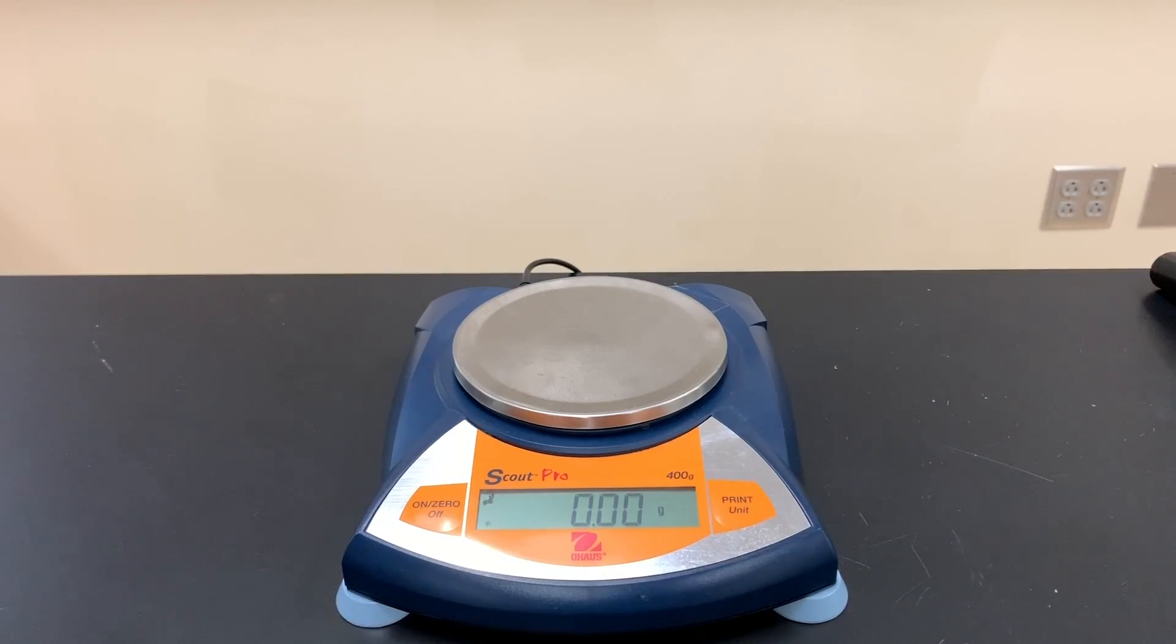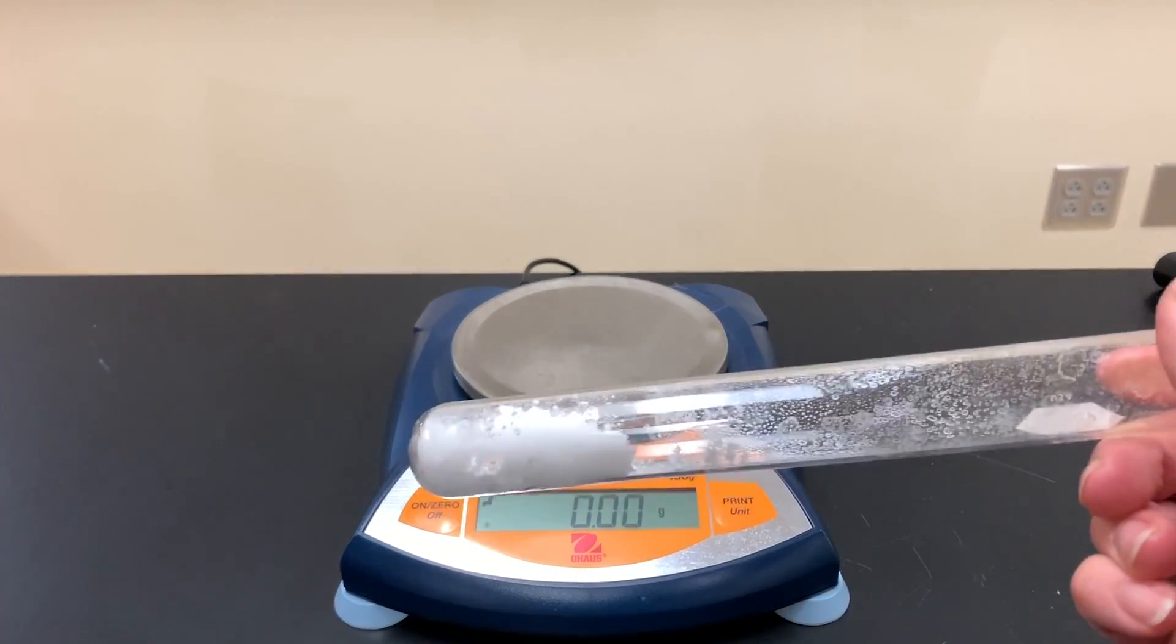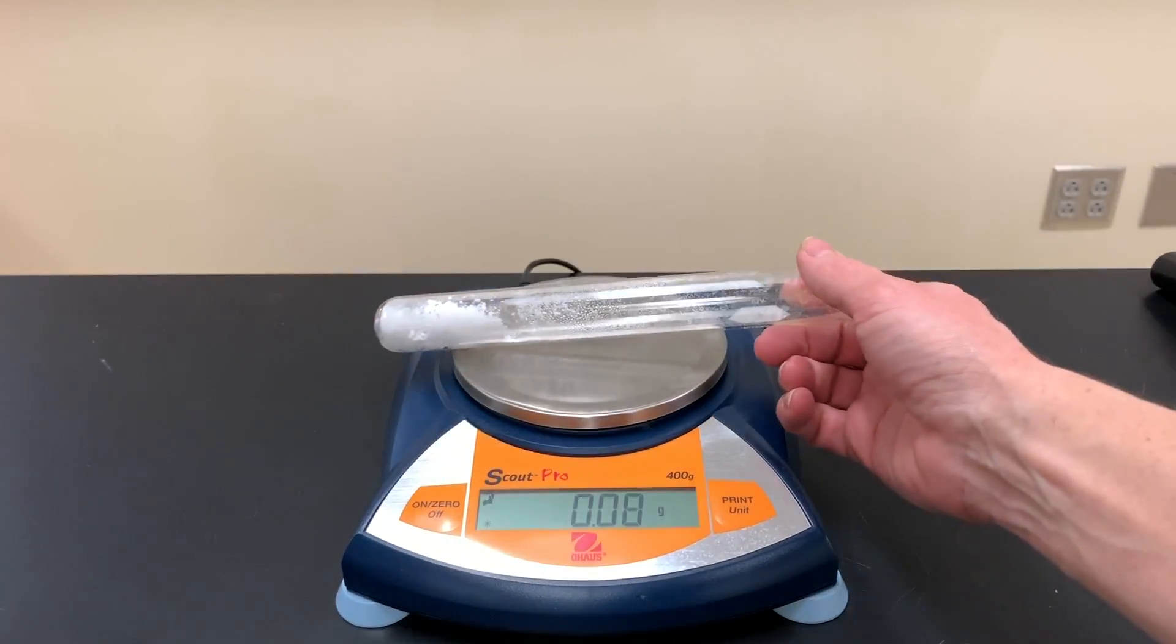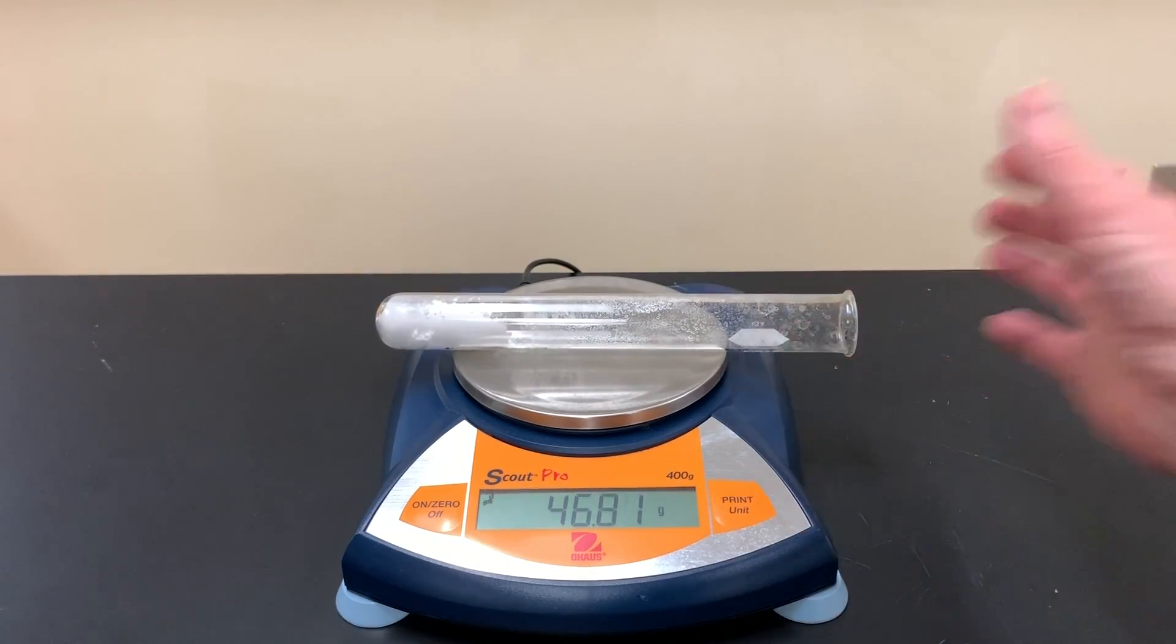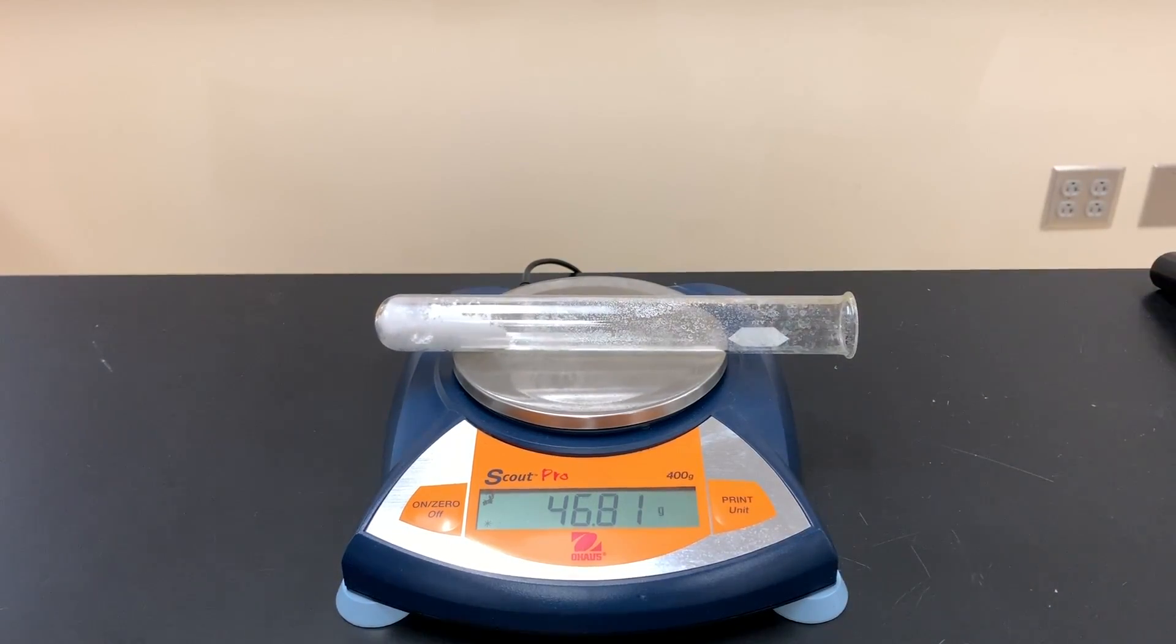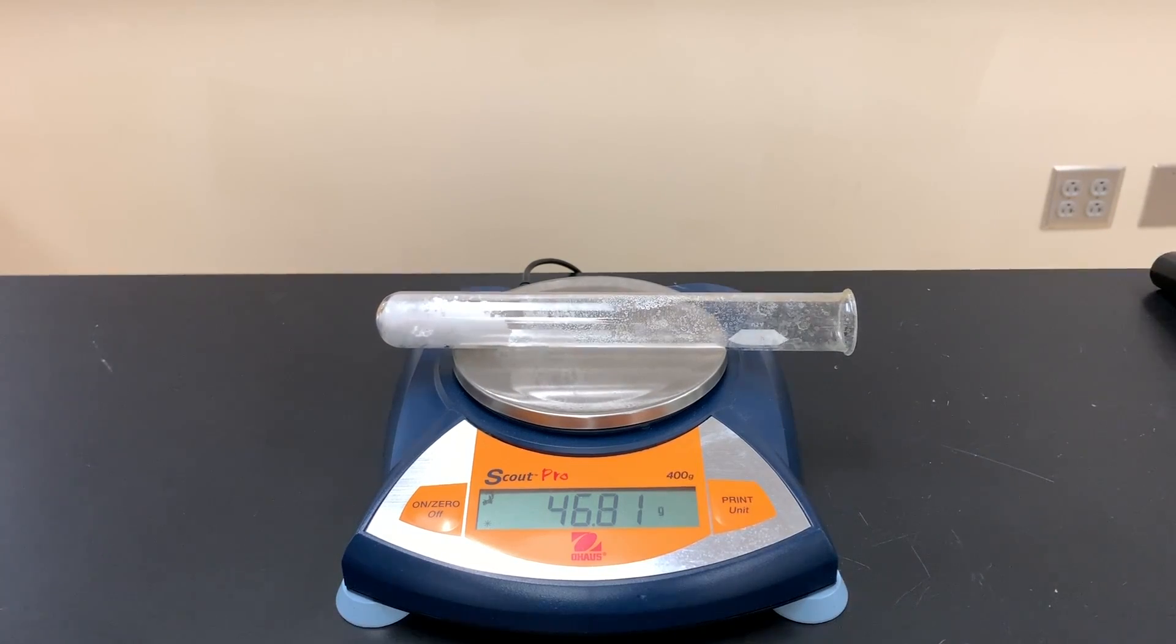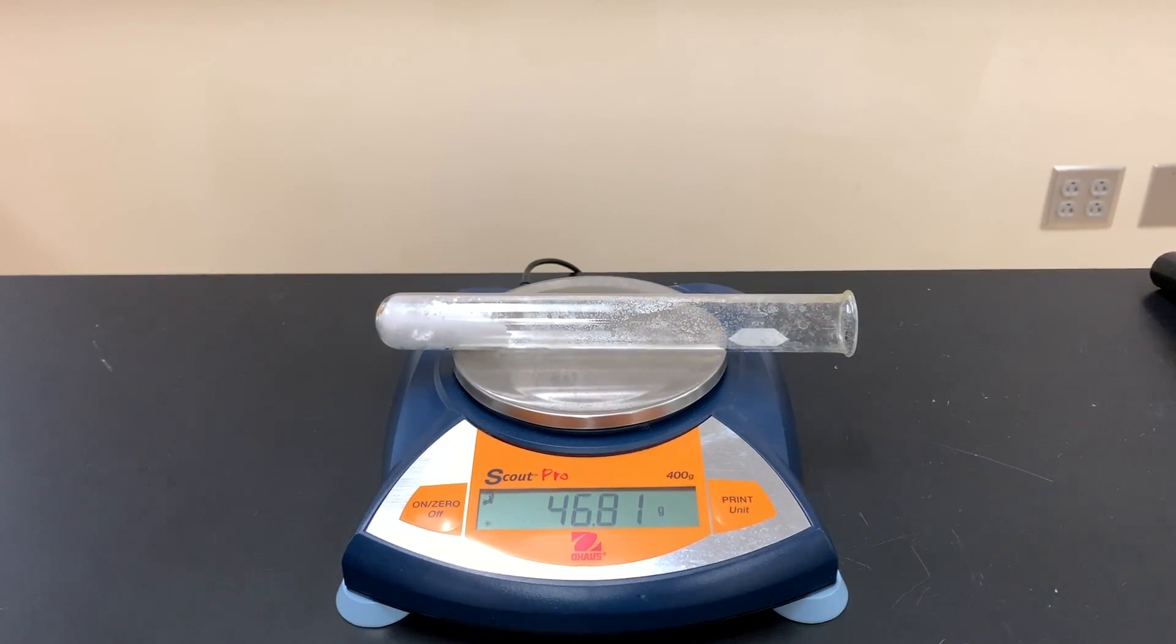So again using that same electronic balance you've used for the first two masses, you're going to take your cooled test tube and place it onto the balance. And we hope that the mass has gone down because it seems that we drove off two of the three products. We believe one's water and one's carbon dioxide.